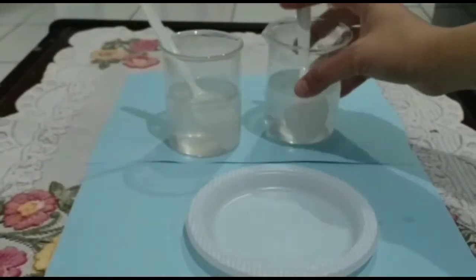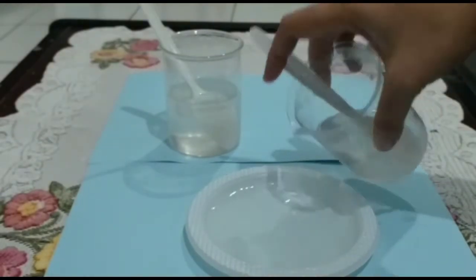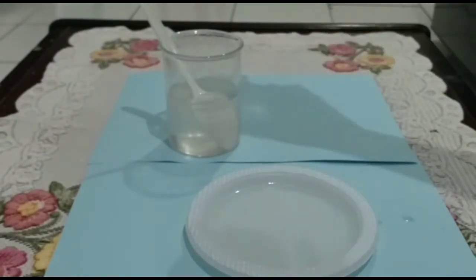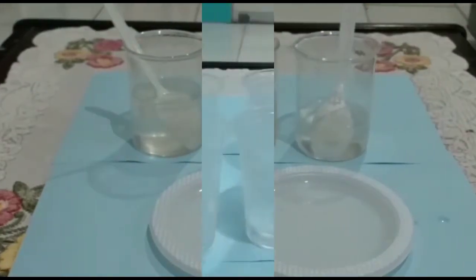4. Put some salt solution from the beaker on the plate and leave the rest in the beaker. Place the beaker and the plate next to a window. What will happen on the next day?